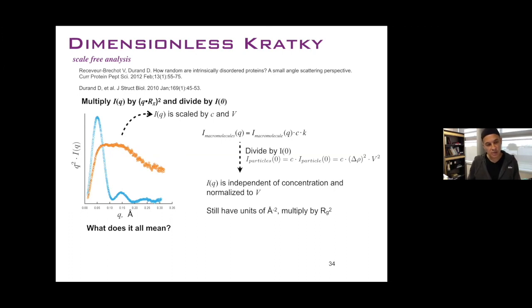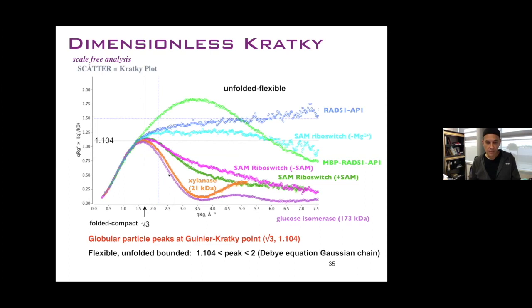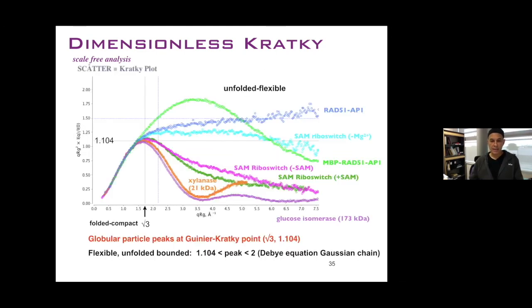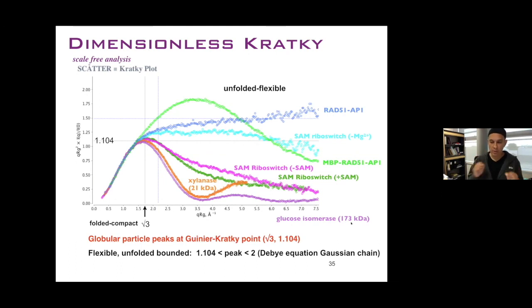You don't want beam stop or aggregation artifacts in the Guinier region because it'll distort the dimensionless Kratky plot. Instead of plotting q²·I(q) against q, we remove units by dividing by I(0) and multiplying by (q·Rg)² in the numerator and Rg in the denominator. For both xylanase at 21 kDa and glucose isomerase at 173 kDa, both globular compact proteins, the peak in the dimensionless Kratky plot occurs roughly at √3 ≈ 1.732 on the x-axis and 1.104 on the y-axis.